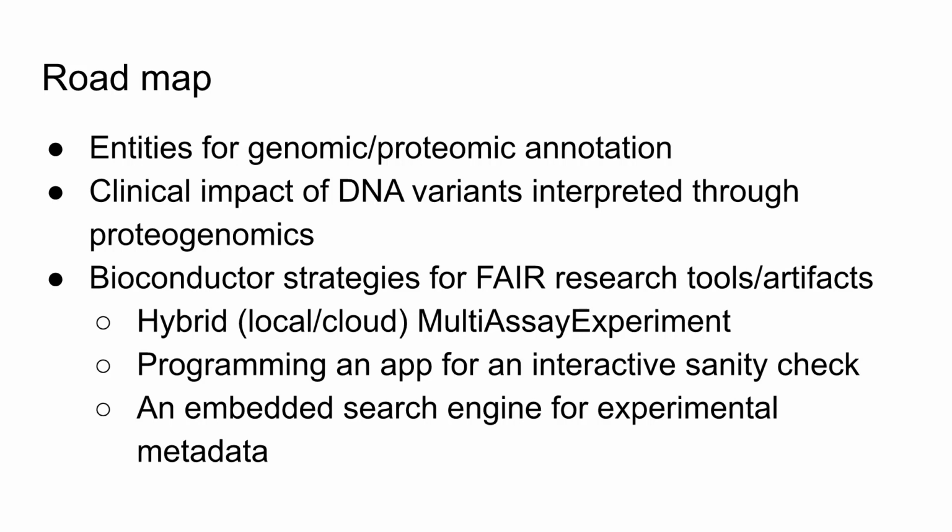And finally, I'll talk about the metadata problem. It's very hard to work with experimental data if we don't know a lot about the experimental conditions. That metadata is growing, getting more complicated. It's often not standard. And so we're going to talk about how to tame that problem.